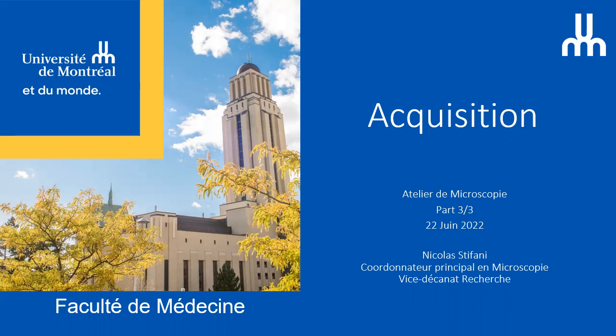But you just need to prepare your sample in a specific way, and you have to process the data in another way. The limitation is also you need to have a very fast system, because since you are imaging for PALM and STORM for a long period of time, if you are not able to take 1,000 images a second or 100 images a second, it's going to take too long to image.